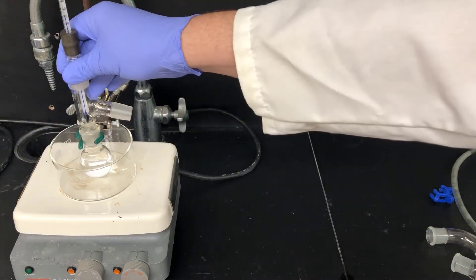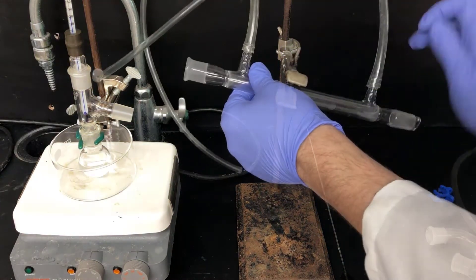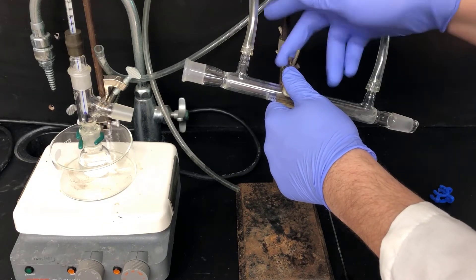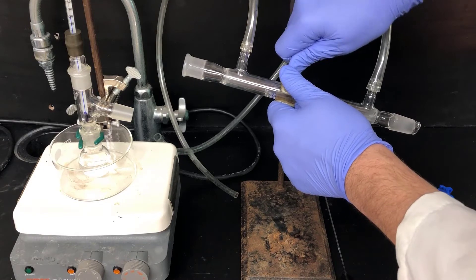Now I'm putting a three-way distillation head on the top with a thermometer. Now I'm getting another ring stand and clamp to secure the condenser, which I'll attach next. Don't try to get away with just one clamp on your distillation apparatus. It's too wobbly. Use two clamps for stability.